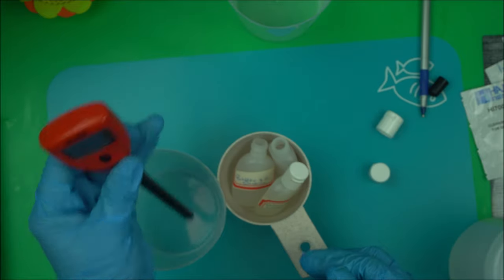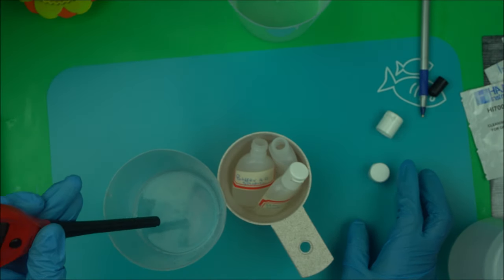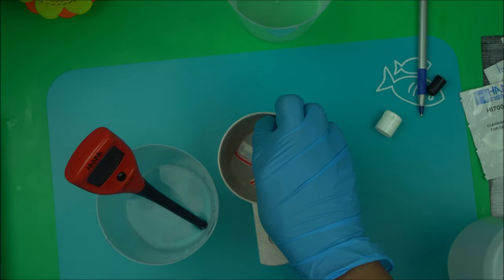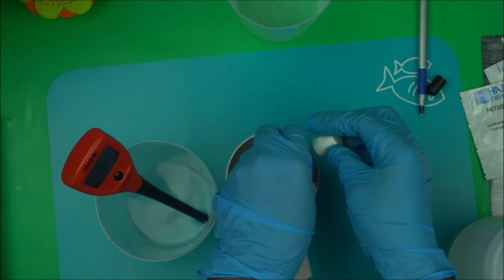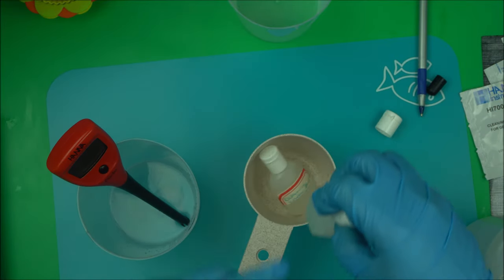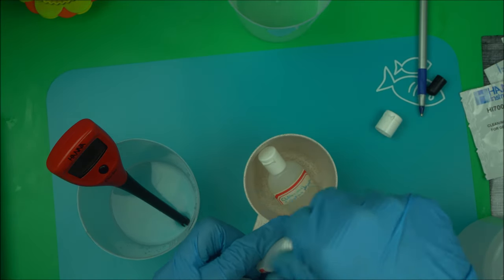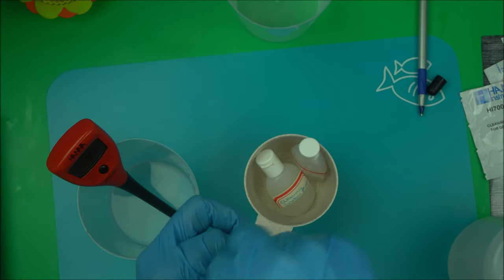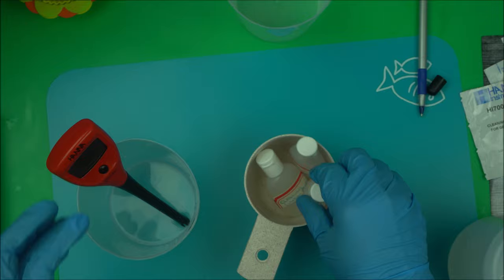When you're done, make sure you cover the buffer solutions — it's very important so they don't get contaminated or oxidized. Always keep them covered when not in use.